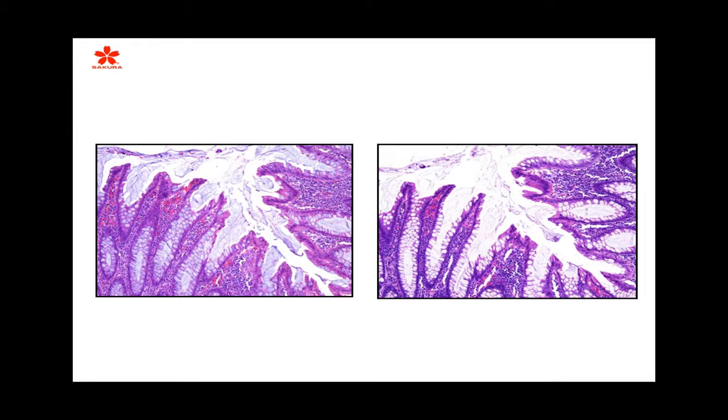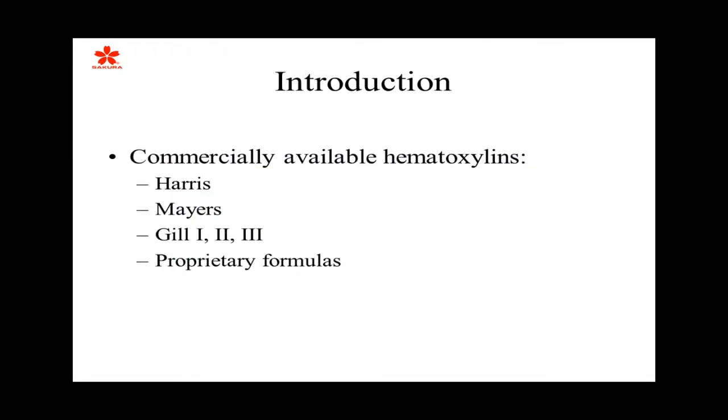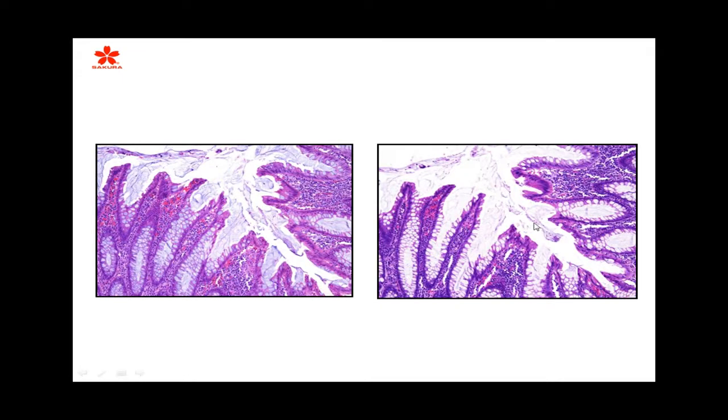I did this to make a point that even though I stained longer in the hematoxylin, because I used the staining system and the differentiation solution in the staining system, I was able to clear out a lot of this non-specific staining. You can see it's a lot lighter now than before. You don't see the staining of the mucin in the goblet cells here.